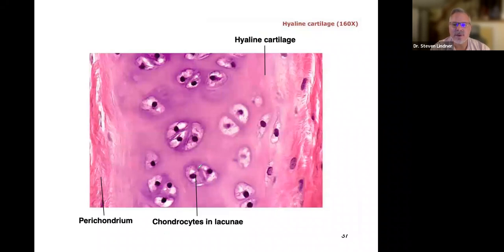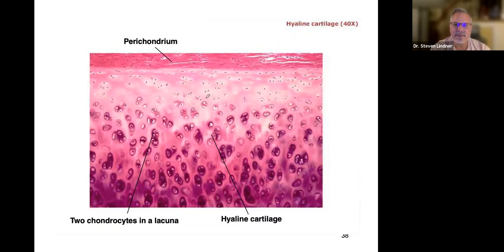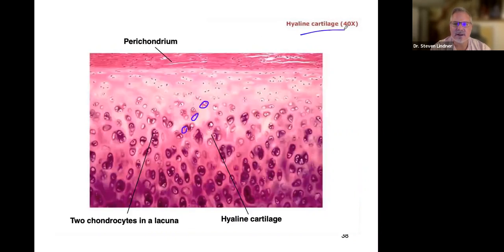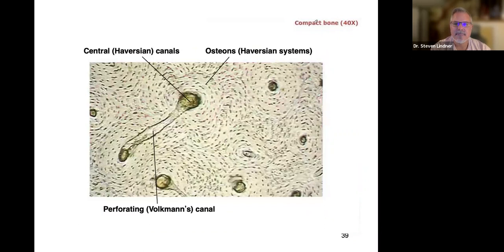When you see these raindrops, this is hyaline cartilage. This is what we find between our movable joints that can degenerate. This type of appearance, where you see these raindrops, these icicle-looking things, is going to be hyaline cartilage. And then here's our compact bone.